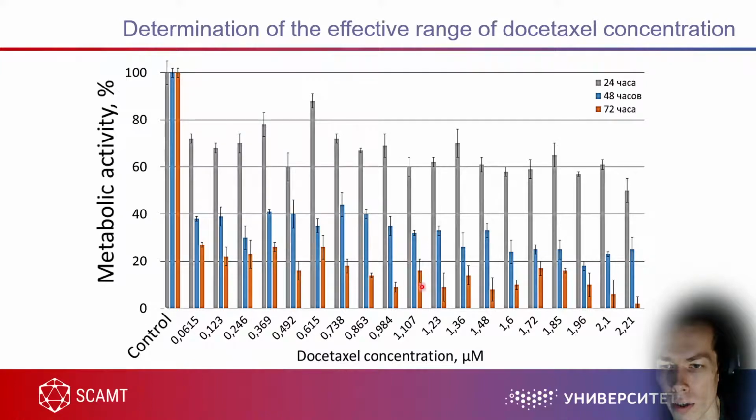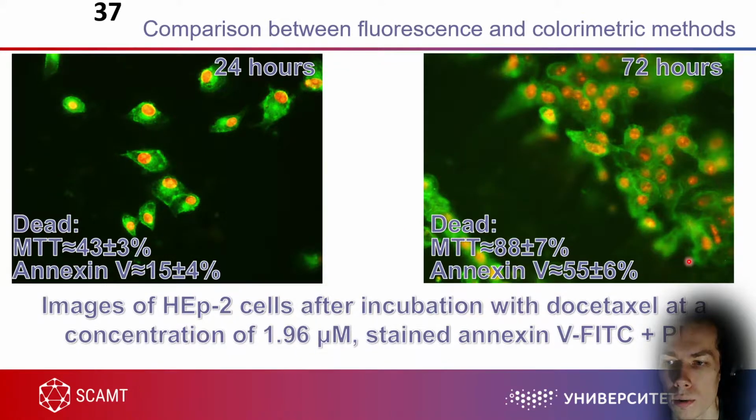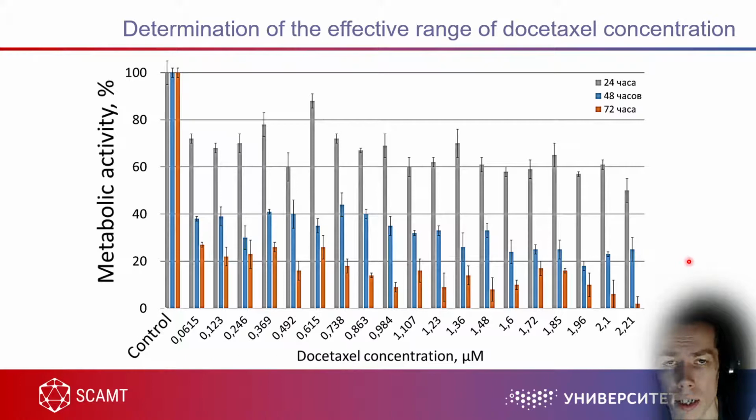It should look like this, maybe just some exponential decrease. And when you are trying to add some additional experiments, like mix, this is the MTT assay.